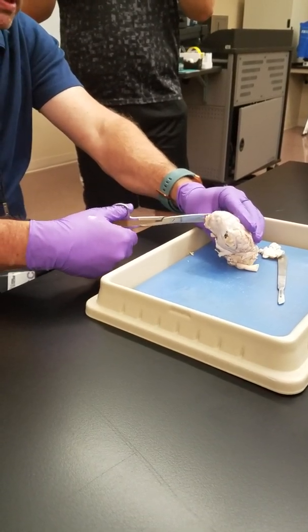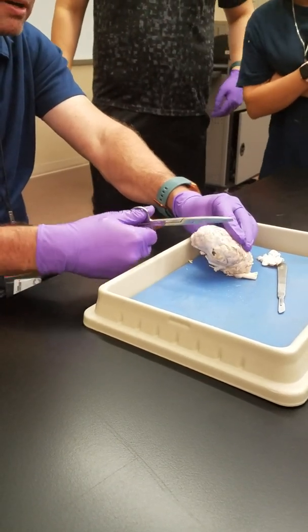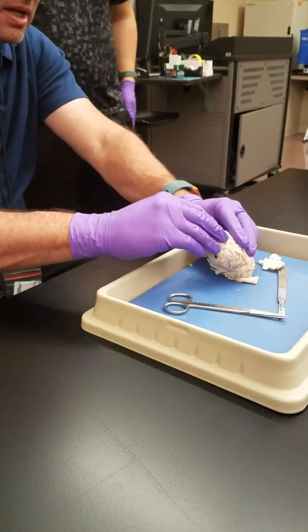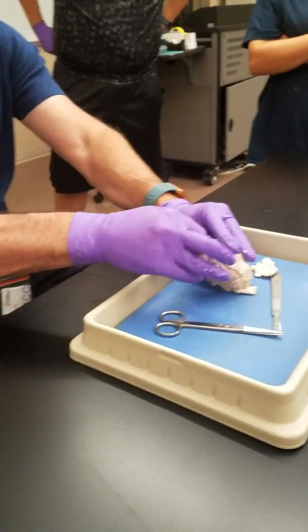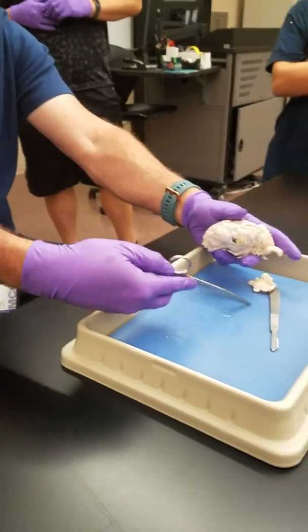What is that lining you're cutting called? It's called the dura mater. The dura? Dura mater, which means tough mother in Latin. Mater, M-A-T-E-R. So mater means mother in Latin.